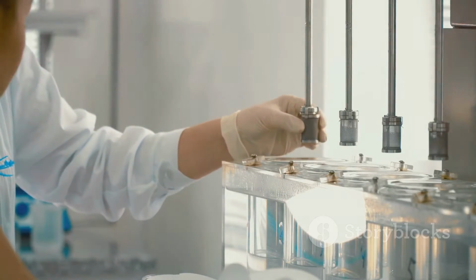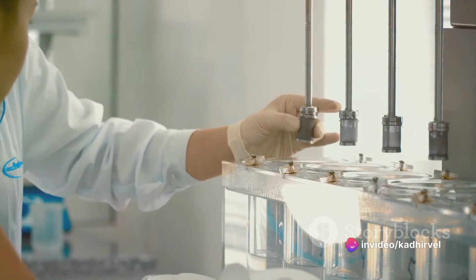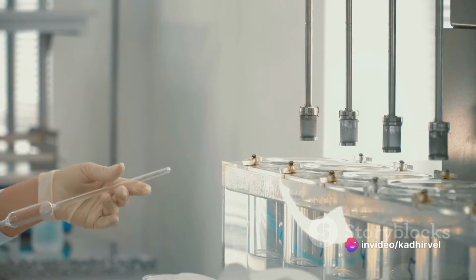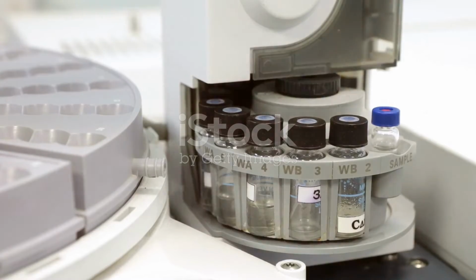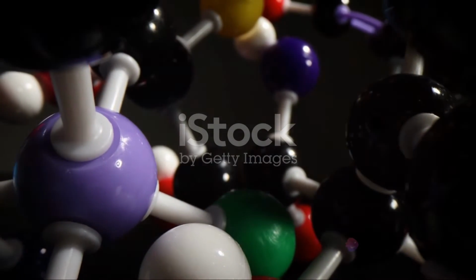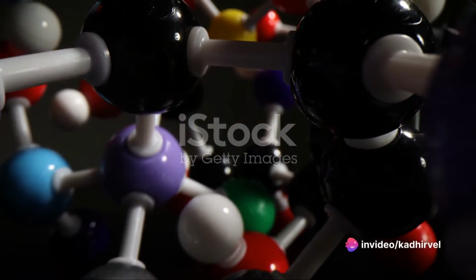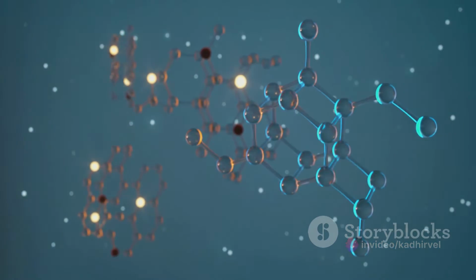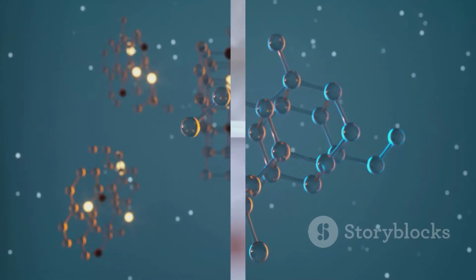Next are the operating conditions. Parameters such as flow rate, buffer composition, pH, and temperature can all impact DBC. The optimal conditions must strike a balance between high binding capacity and efficient mass transfer kinetics. Third, the characteristics of the sample can influence its binding capacity. The properties of the target molecule, like size, charge, hydrophobicity, and affinity for the stationary phase, all come into play.